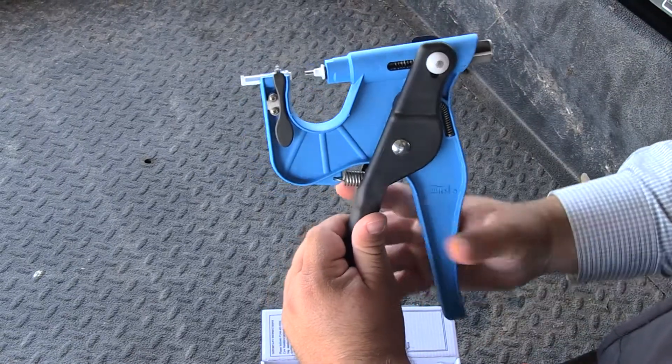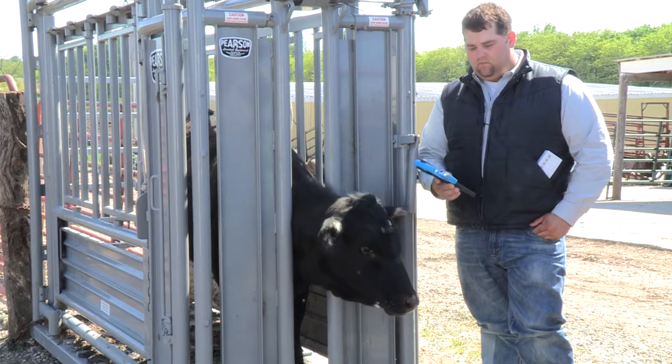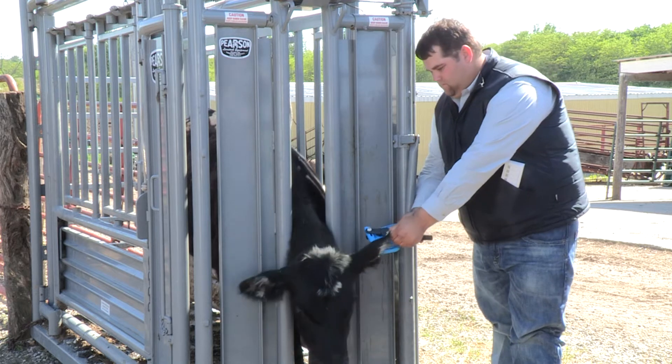You take a sample inside the hairline of an animal just by one squeeze of the applicator. We're going to grab her by the ear and actually take the sample in one quick motion.